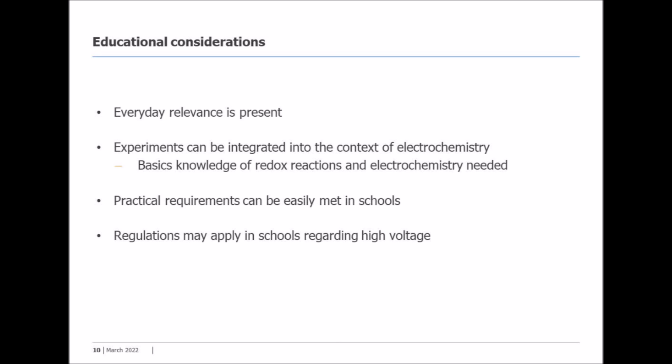Additionally, the practical requirements can be easily met in schools, since only titanium sheets, oxalic acid, and common voltage sources are needed. The short reaction times allow for the fabrication of a wide range of colored titanium sheets, making the experiment visually appealing.